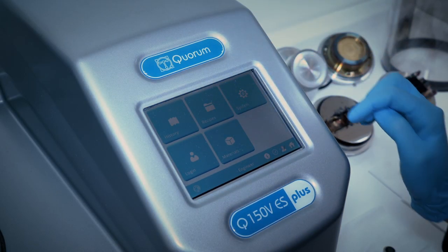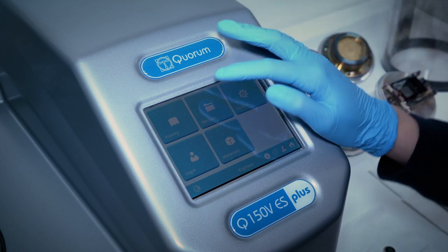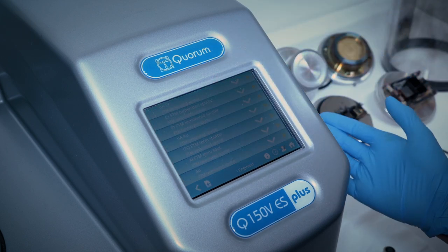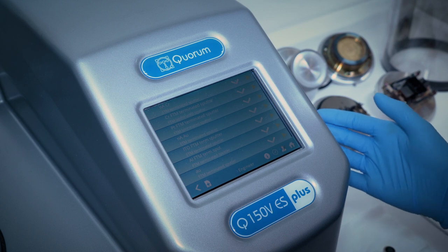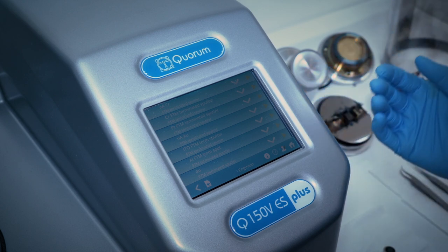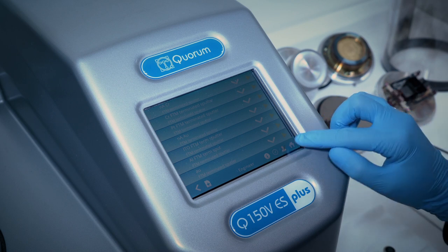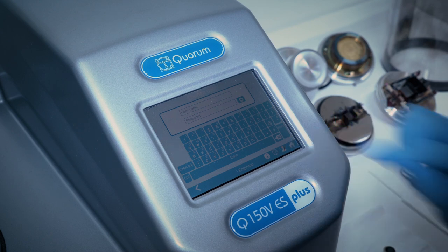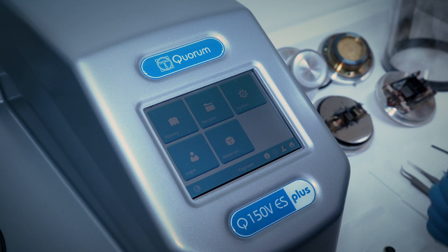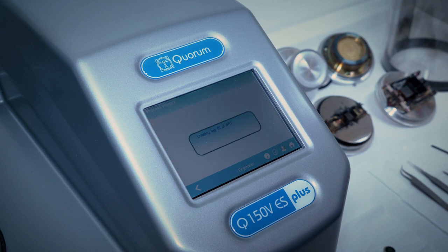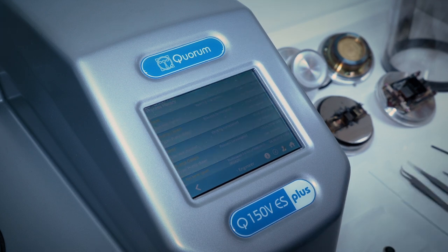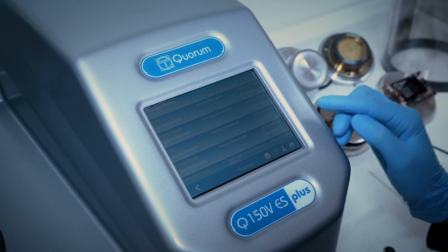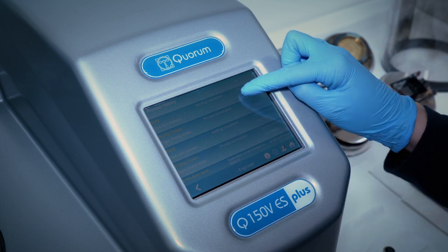The software of Q150 V Plus allows users to access and edit many parameters as well as creating new profiles that are not under the default list. Each user can have their own profile and store recipes in the memory. This can now accommodate over 1000 recipes. The history button allows to access past processes and view their parameters. The USB connection also allows to copy the log files if more intense study on parameters is needed.